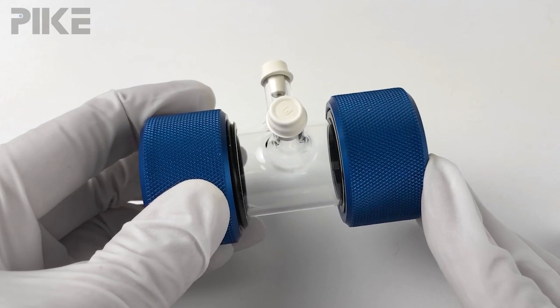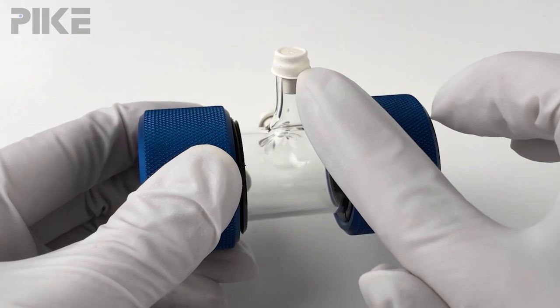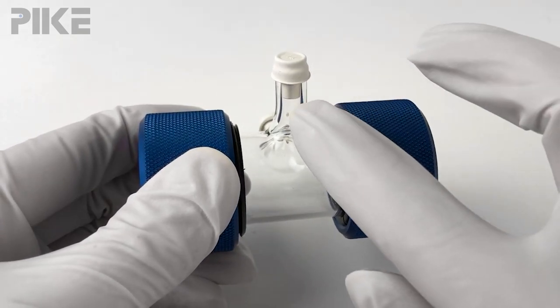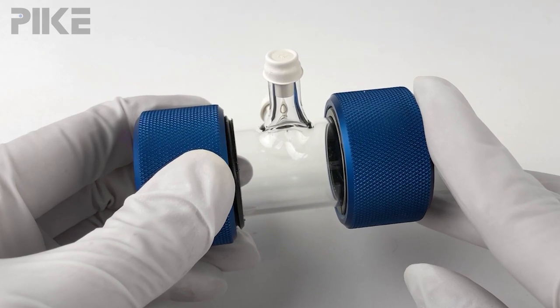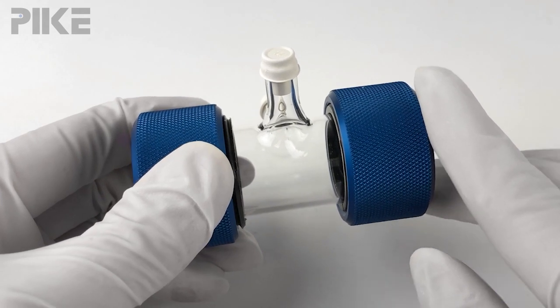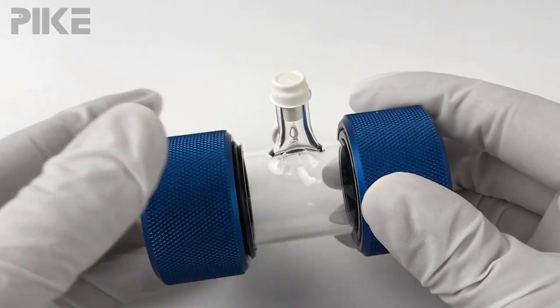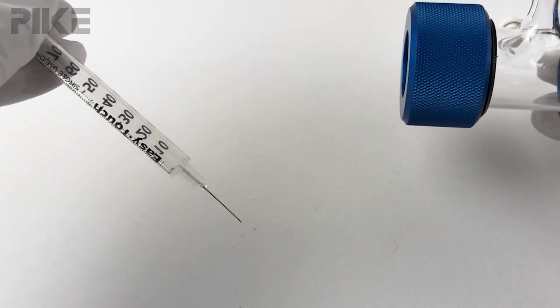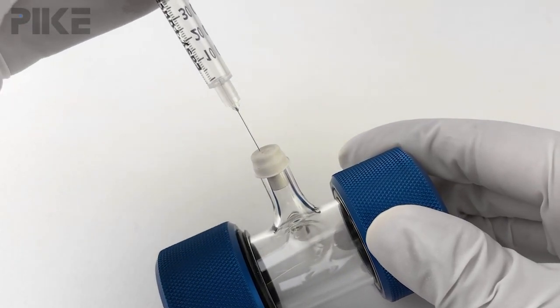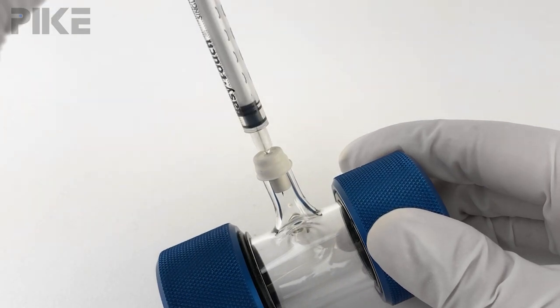There are a couple convenient ways to fill the glass gas cells. One, remove the septum cap and just slide tubing over the stem. Alternatively, which I'd like to illustrate today, you can fill your gas through the septum cap using a syringe with a needle. Just draw your gas sample into a syringe, go ahead and pierce the septum cap, and fill your gas cell.